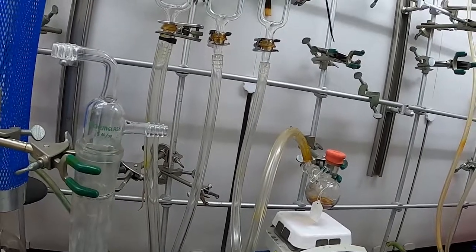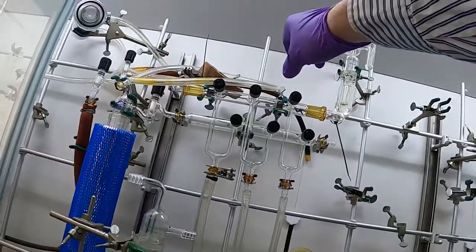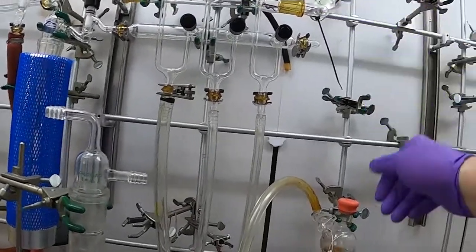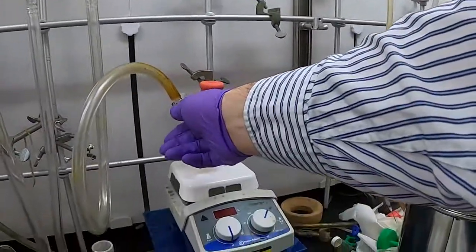What we can do then is on our Schlenk line, open our gas line here. You can see that's our top one. This will let gas into our reaction. We then open it to our flask.